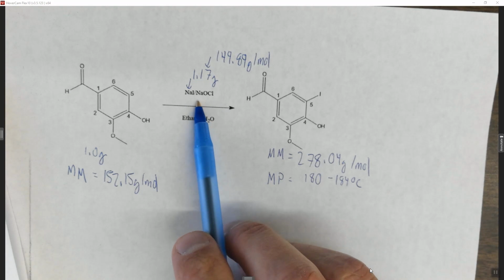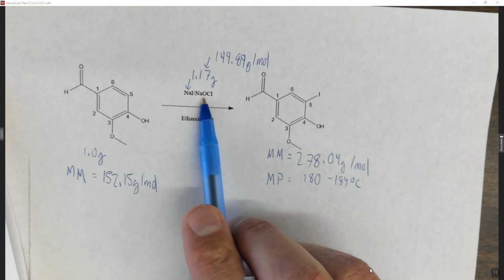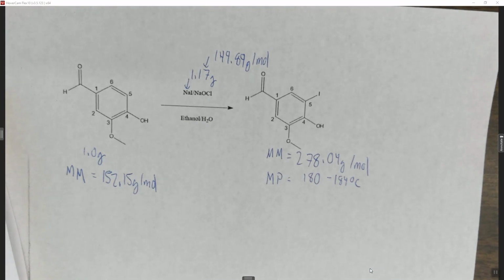Okay, you're going to do this under the extractor arm to be safe, but you're also going to make sure that you add the sodium thiosulfate to destroy the bleach first, because you don't want to be breathing in the chlorine gas. Then what you're going to do is use 5% hydrochloric acid added in 1 milliliter portions. You're going to test the pH each time using pH paper, and you're going to wait until it turns acidic.